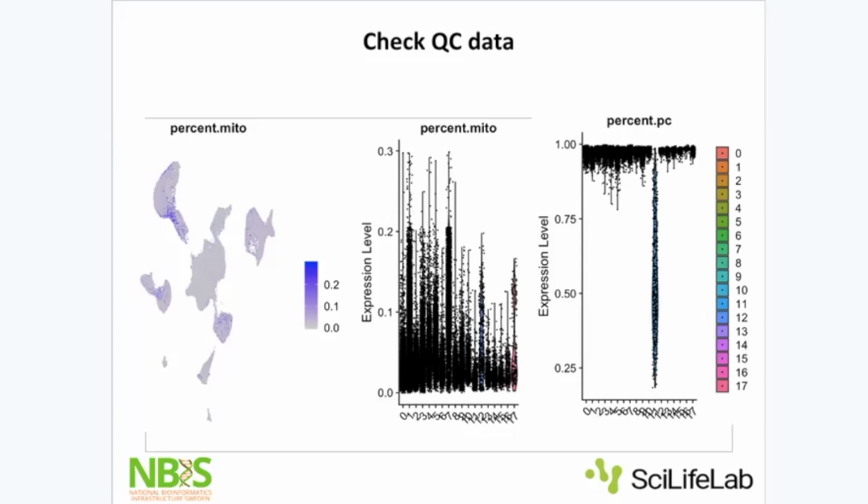And I've seen in almost all papers when they do these sort of clusterings, they always use Leiden. So in my group we've just accepted that, okay, we're going to use Leiden, but this was integrated in Seurat so recently that before it was a bit hard to do.